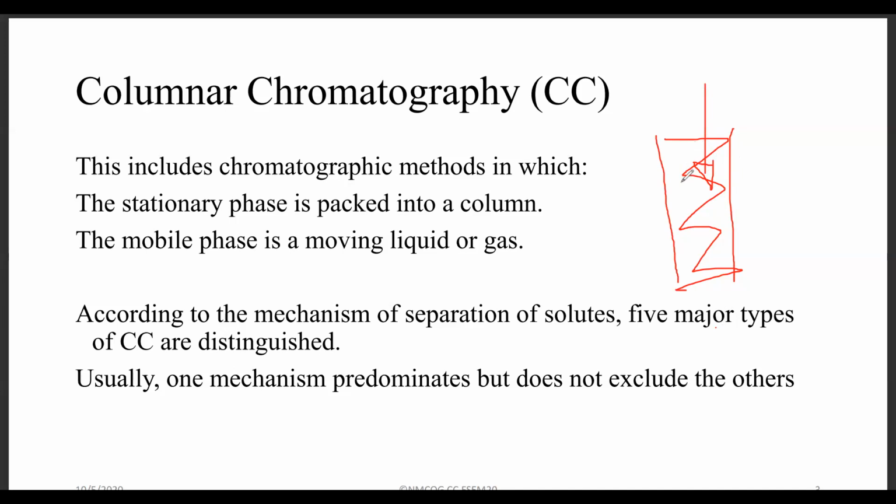So based on the polarity difference between the mobile phase and the stationary phase, our analyte can either decide to attach to our stationary phase and therefore move slower through the column, or it can oppose the stationary phase and move efficiently through the column.